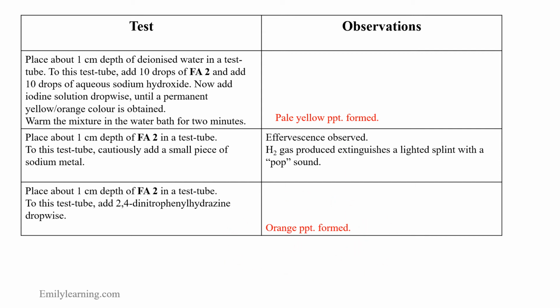That means I must have a carbonyl group. So in other words, the carbonyl group present is a ketone. All right. Okay, so now we have completed all the tests required for your qualitative analysis practical on organic chem. So next, let's do some deductions.